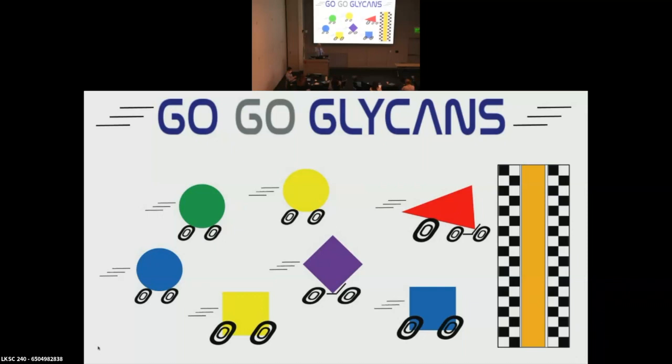Those tend to light up, meaning we can see a glycan signal better than the ones that are right next to the tumor or in the tumor. And with prostate, it can be a heterogeneous environment compared to the other solid tumors. That seems to be the trend, though: the closer you are to the tumor or within the tumor, the less signal.